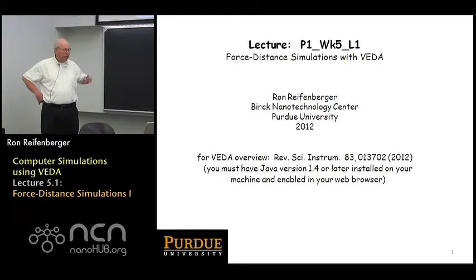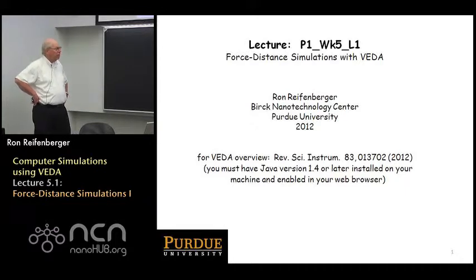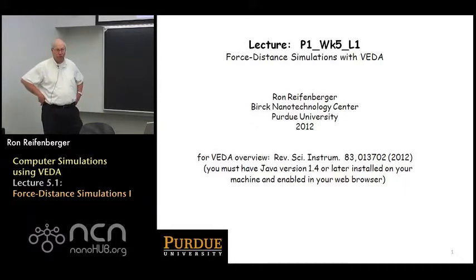And to do that, we're going to rely heavily on this software called VEDA. We've already talked about VEDA in week 3, and specifically the second lecture in week 3. So by now you should be able to get ready access to it on your computer.